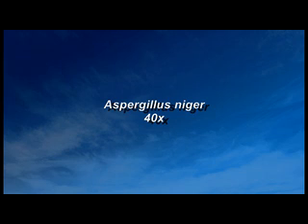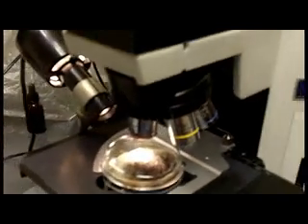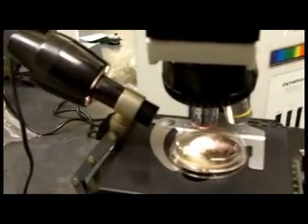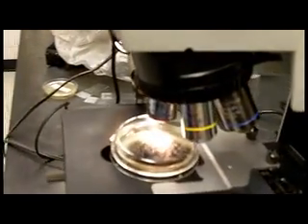Aspergillus niger under 40x power. The contact auger plate is placed directly on the microscope stage with lighting at approximately 30 to 45 degree angle. This gives a nice 3D effect of the aspergillus niger heads seen here looking through the microscope.